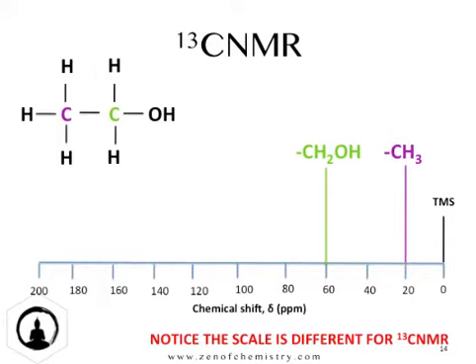So if you saw this without any information at the top here, if you just saw two peaks, what you get from that is that there are two carbon environments, and from the chemical shift you may be able to deduce exactly where that comes from. Sometimes that's not a telltale sign, so if you've got a range of your chemical shift, they can often be anywhere in that range depending on the molecule.